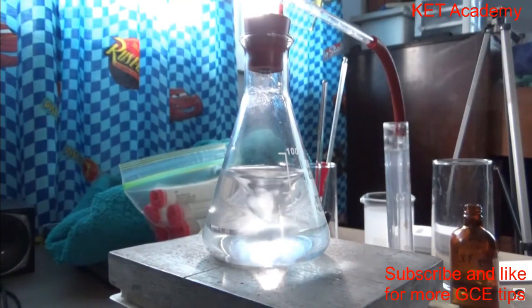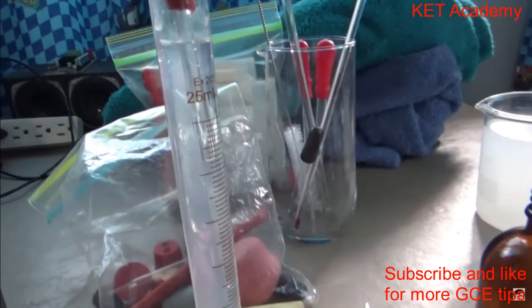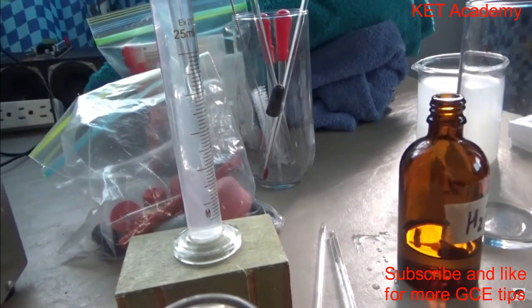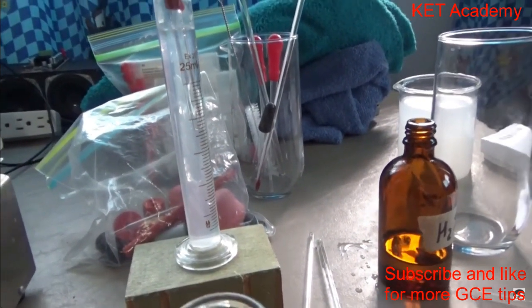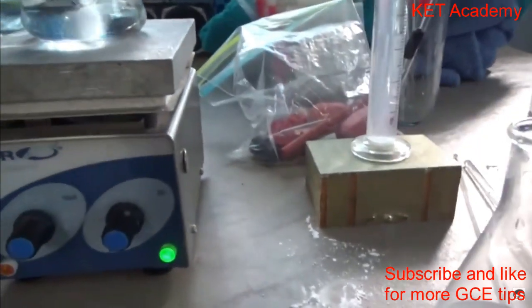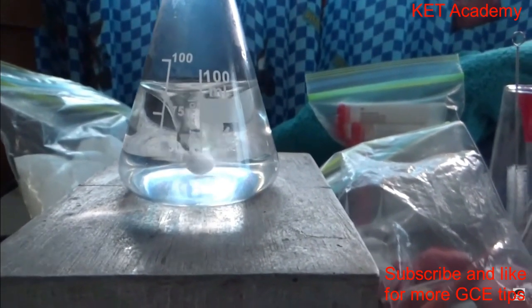Okay, we are producing a gas. I don't know if you can tell that bubble is moving down. We are producing a gas. I shouldn't have used that long of a tube, but it should be fine. It's going down just fine. There it is. Make sure that's capped properly.